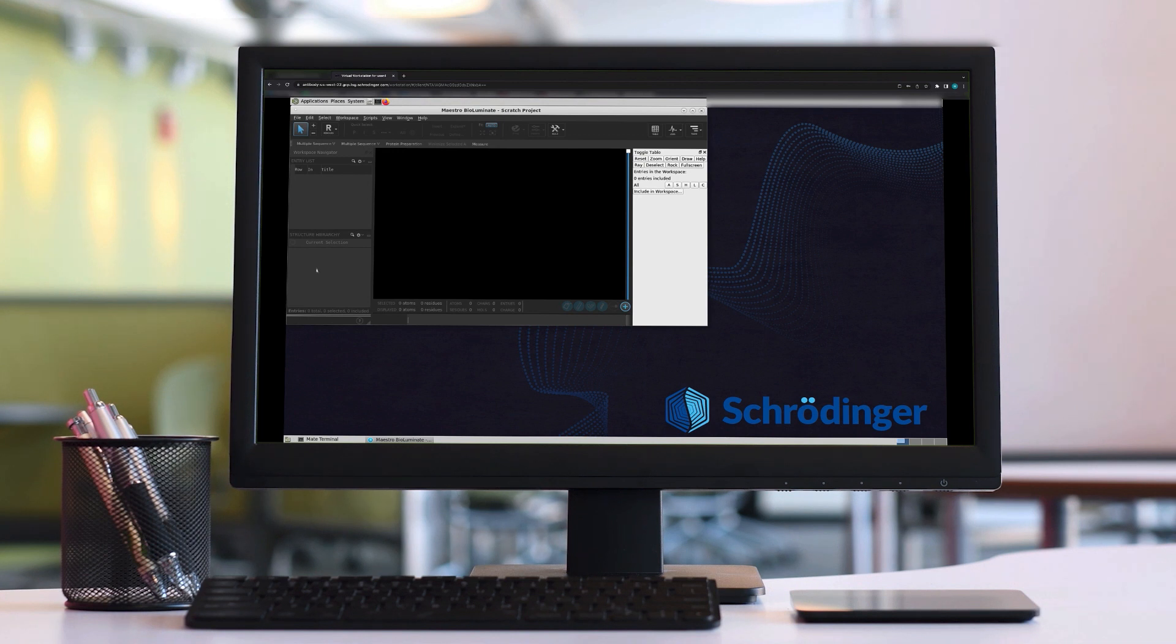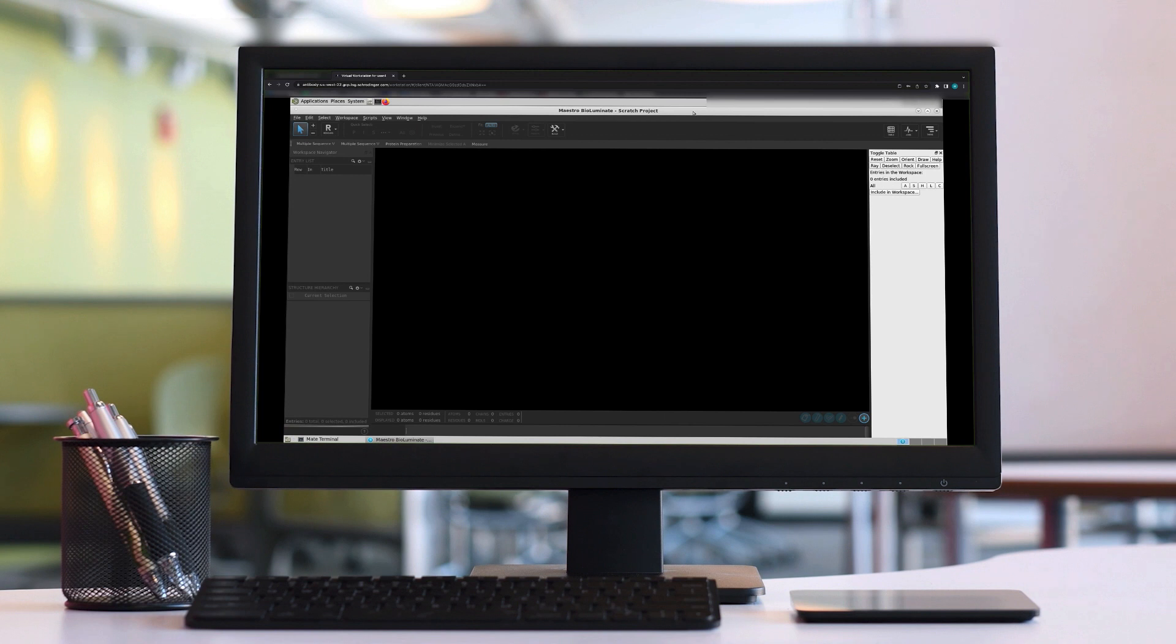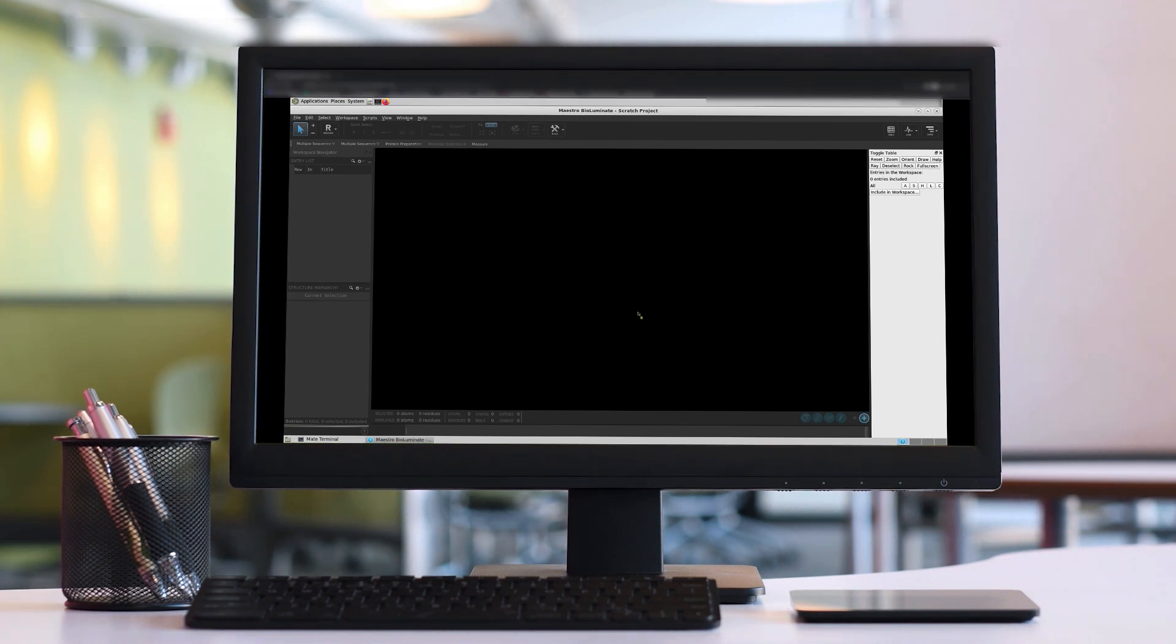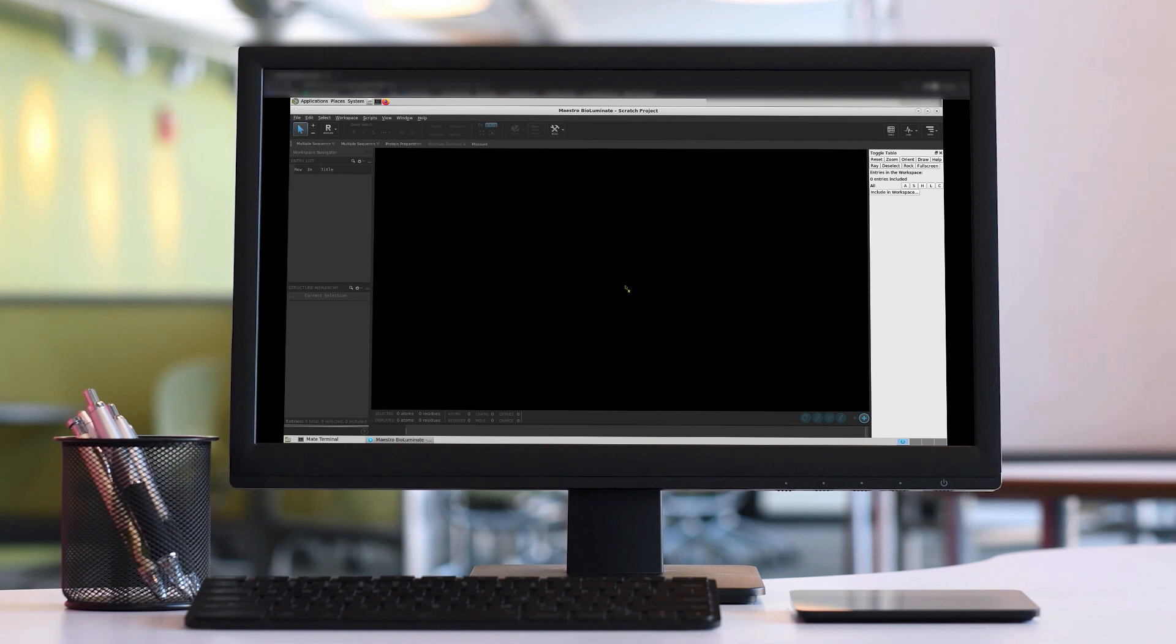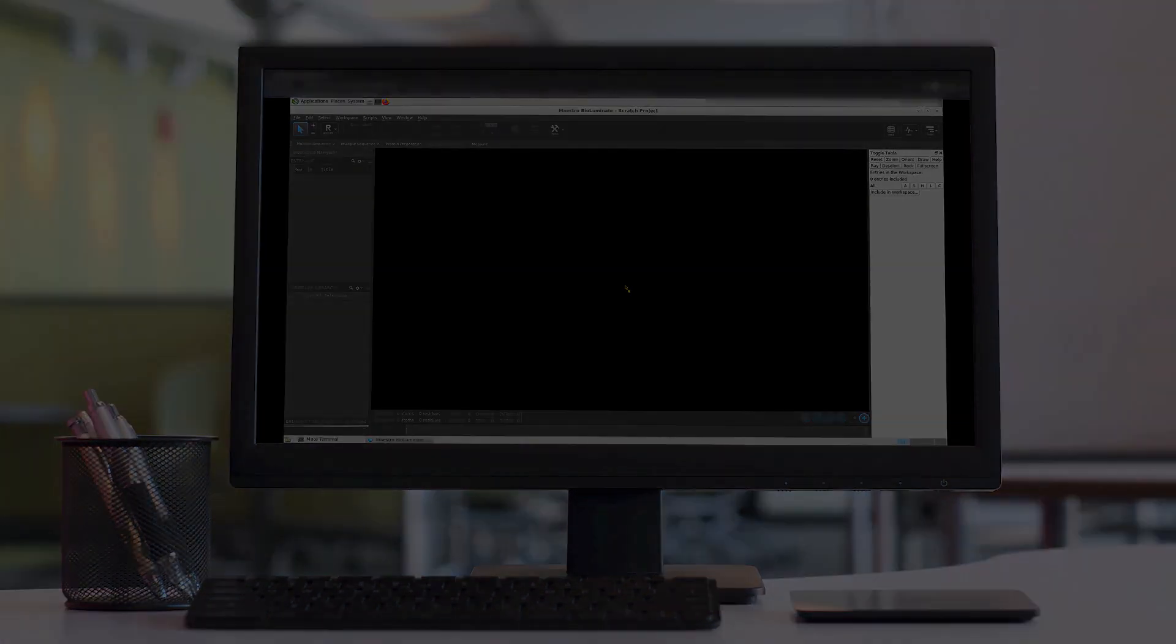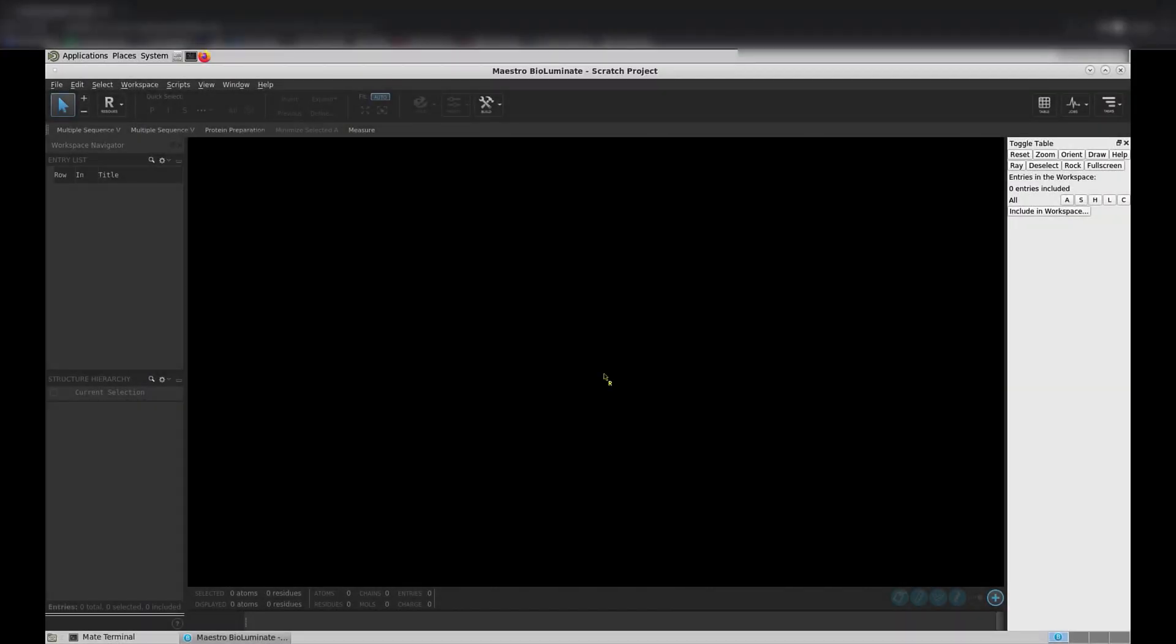Let's maximize the BioLuminate window so it takes up more of the screen. Now, before we load in any structures, we are going to change our working directory. We recommend that you do this before doing anything else when you open BioLuminate. The working directory is where any files you generate in the BioLuminate session will be written. It is also where BioLuminate will look first for any files to read in.